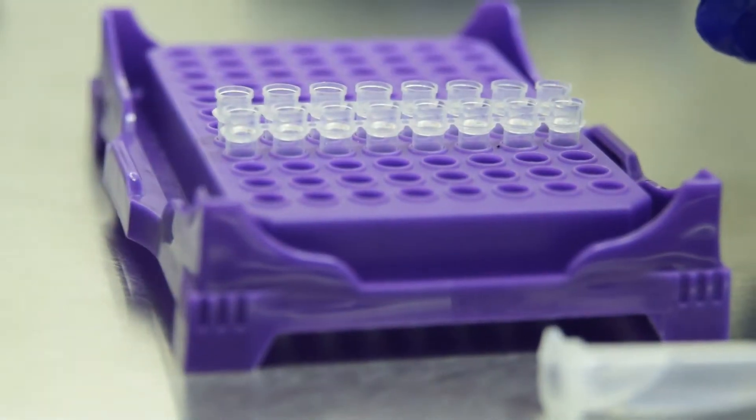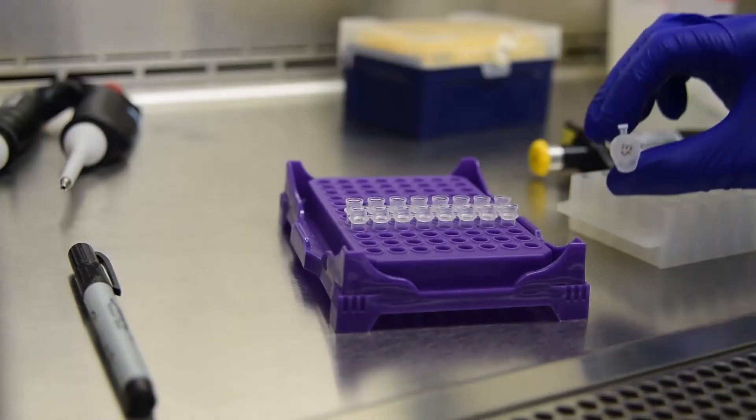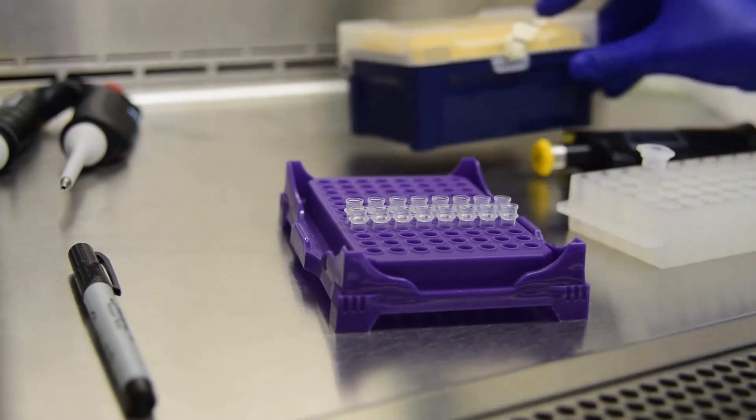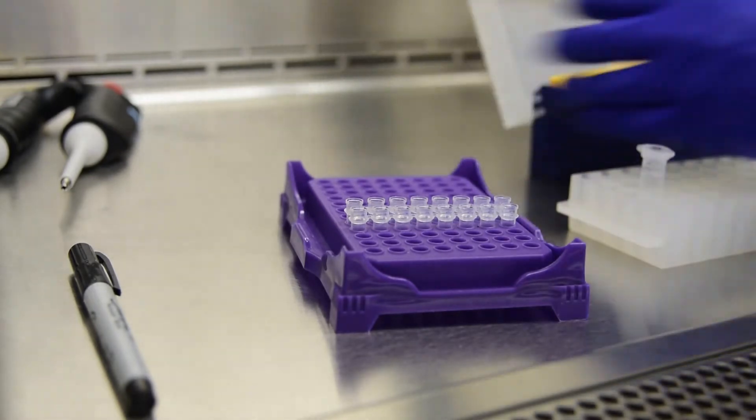Check the orientation of the strips. You can use 20 microliter filter tips for filling strips. You will likely only need one tip.